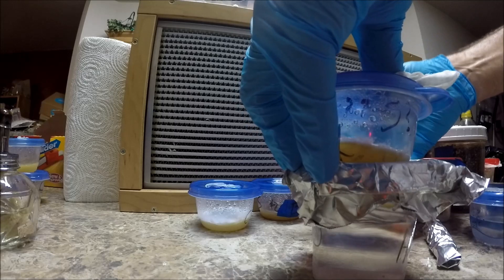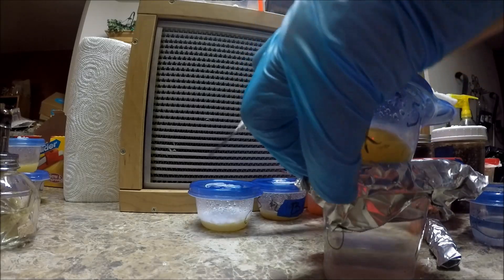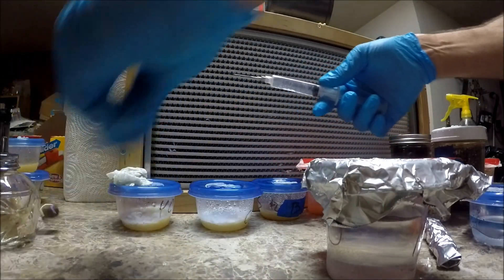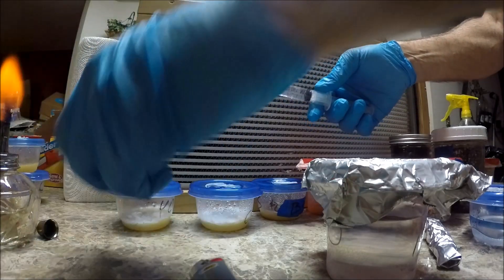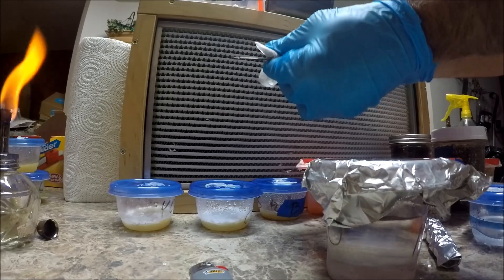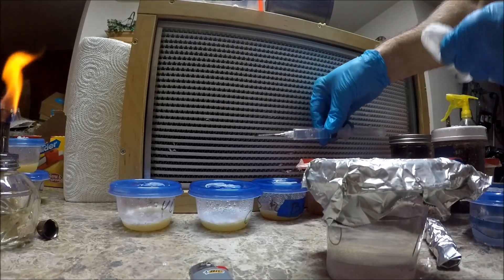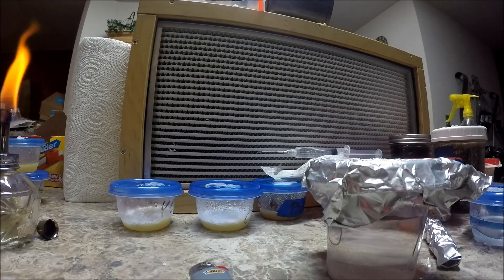Now we've got 8 cc's of mycelium water. I know it's kind of hard to see, but it's in there. It doesn't take much. If you wipe down — now that we have that, we're going to start injecting everything else.